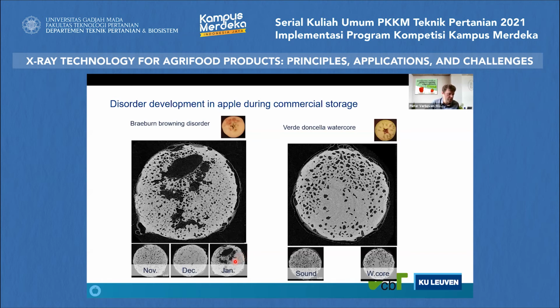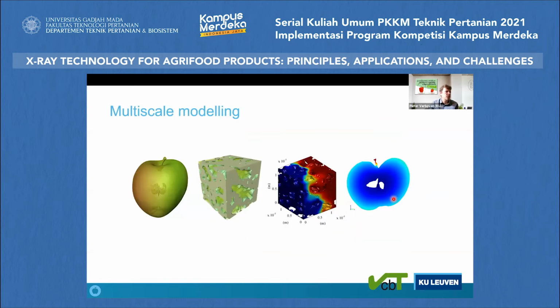Yeah? So we'll have a lot of cavities, a lot of destruction of the tissue. It will not taste, and it certainly will not look nice anymore. So it will allow us to study this process. On the right-hand side is another application, but I will not touch upon that for the sake of time. And then finally, X-ray allows us to do these morphological measurements, to create models for that, also on the micro scale. Then, of course, we want to use them in our computational frameworks to understand better what is happening.